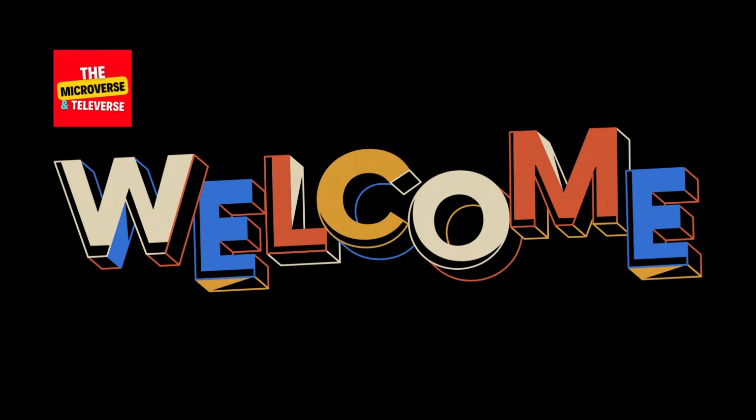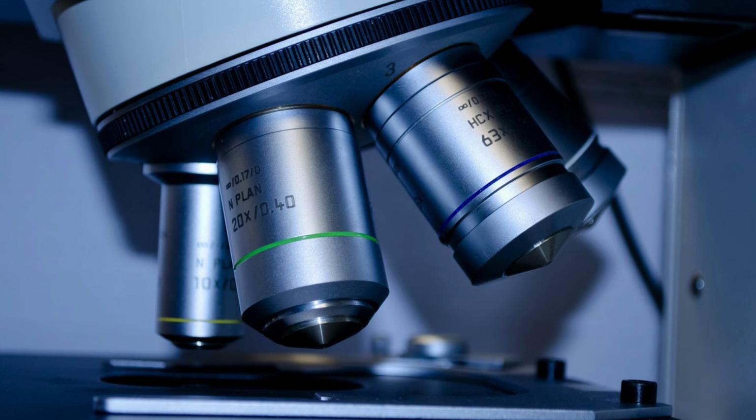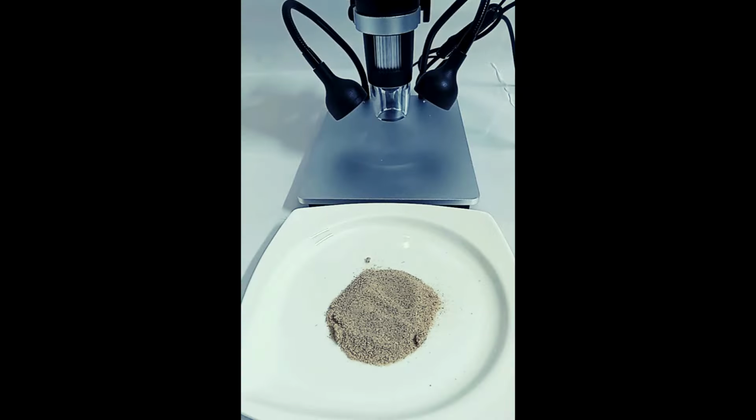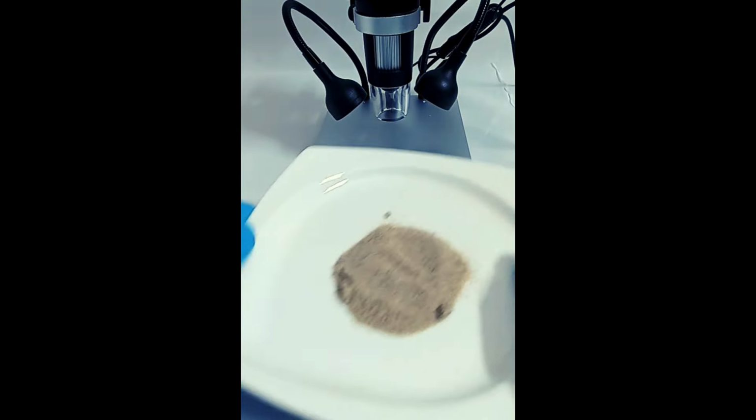Let's dive into the fascinating world of washed colored sand under the microscope. First up, take a look at this vibrant tray of washed colored play sand. Isn't it a sight to behold? Now, we're placing a sample of this sand under our microscope, ready to uncover its hidden beauty.